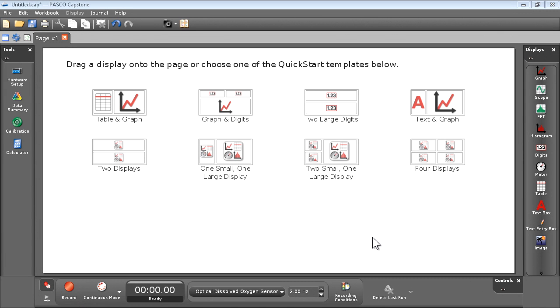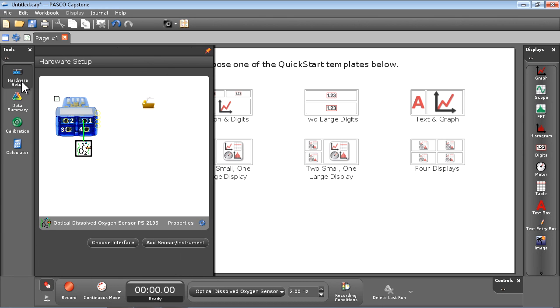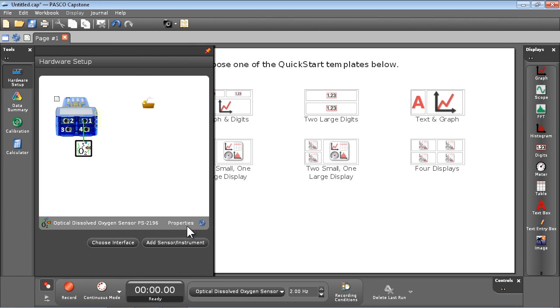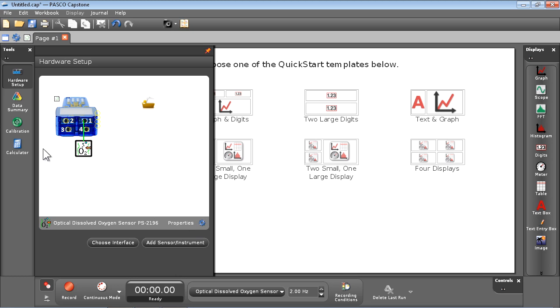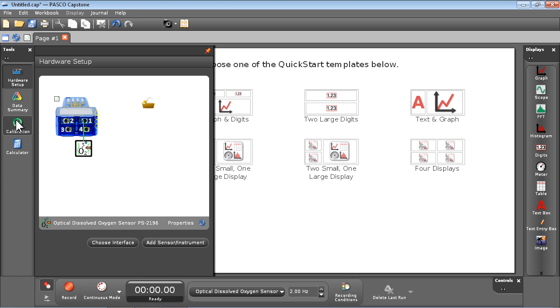To use the Optical Dissolved Oxygen Sensor in Capstone, you can set the salinity constant or replace a sensor cap in the Sensor Properties menu under Hardware Setup. To calibrate the sensor, we'll use the Calibration menu.